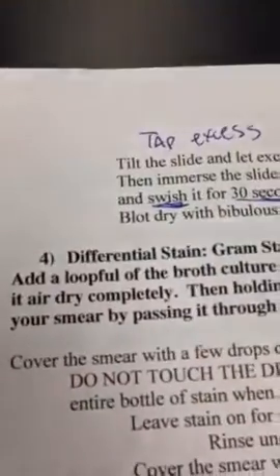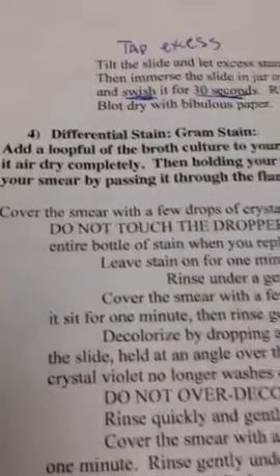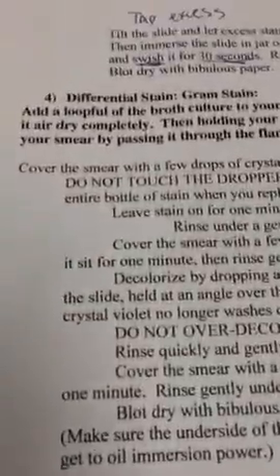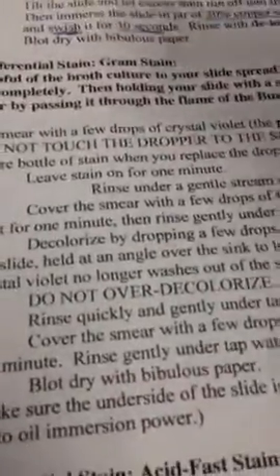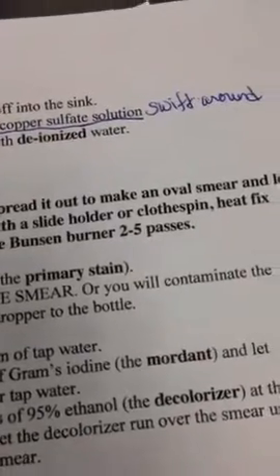With your acid fast stain and your Gram stain, you are going to have to remember the steps. Differential stains differentiate one kind of bacteria from another kind of bacteria based on differences in their cell wall. So differential stains, in this case acid fast and Gram stain, are for differentiating bacteria with different cell walls. You do have to memorize the steps and what's happening in each step. That's why you'll see I have the primary stain step, the decolorizer step, the counter stain step. You're going to have to understand what those different steps mean.